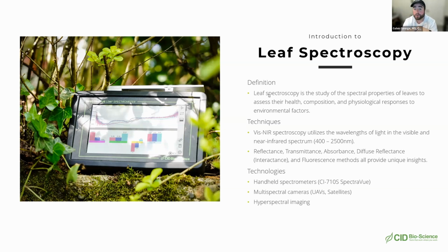The next question is, I need more details on the indices calculated and their range. Okay, well, that's a great question. If you go to our website, and Susie posted the link to the 710s specifications, you can also download our index list. We have the index list posted and available, and it has all the indices and what their ranges are, because there's 40 plus of them right now, and I don't know every single one off the top of my head.